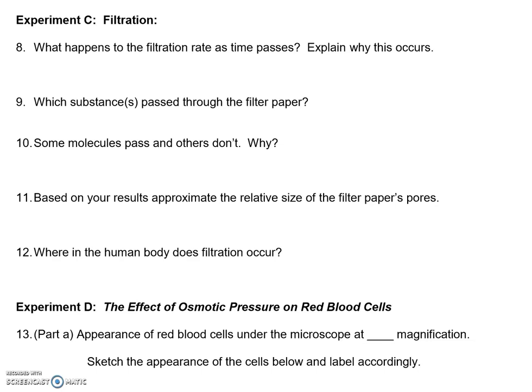And so we have to use an indicator solution. We use a drop of iodine, dropped onto the filter paper, to demonstrate the presence of the starch particles, because the filter paper will turn dark blue when you put a drop of iodine onto that spot where the starch is. Anyway, so let's answer the questions.